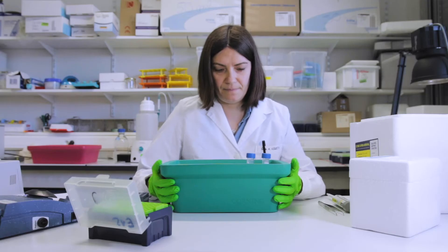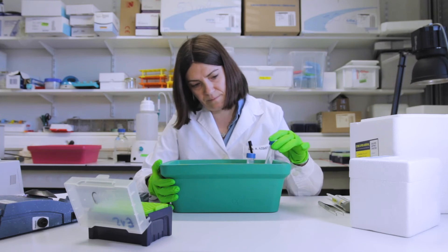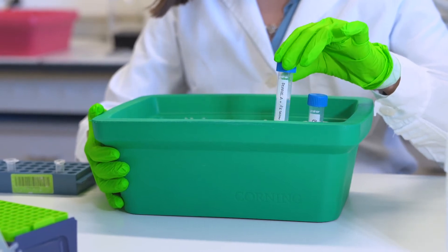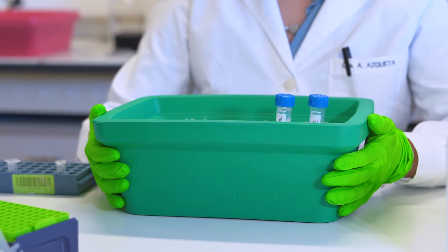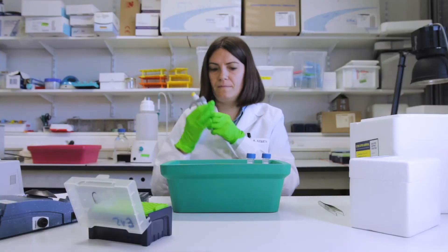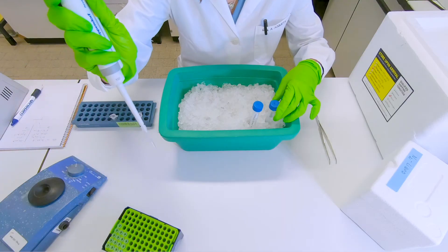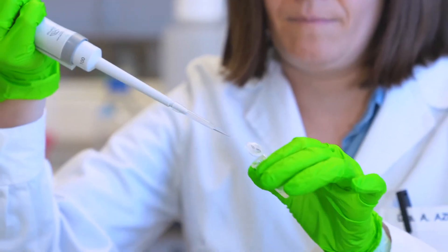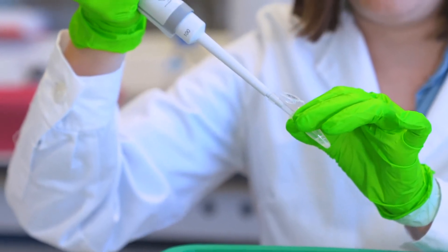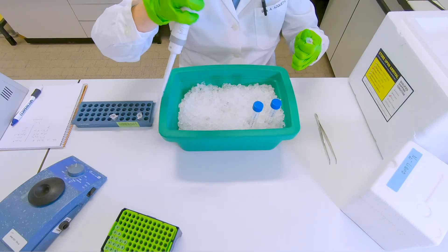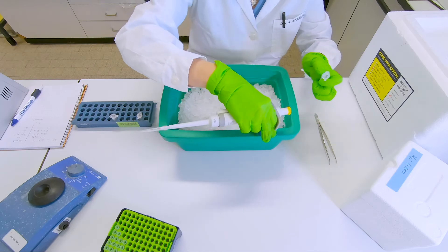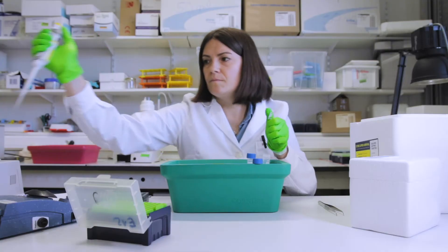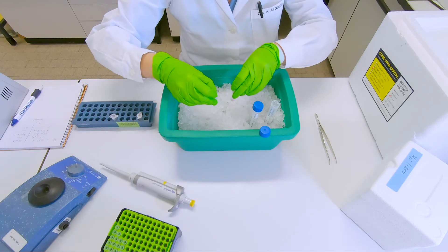So first we're going to add buffer A. It's best to prepare buffer A cold. And in parallel, you can also prepare upfront buffer A together with 1% of tritone. So we start off with the buffer A. We have a cell pellet of 5 million cells, to which we will add 50 microliters of this buffer A. We usually work with 30 milligrams of ground tissue. And to this 30 milligrams of tissue, you add 100 microliters of your buffer A. Both of them will be vortexed.